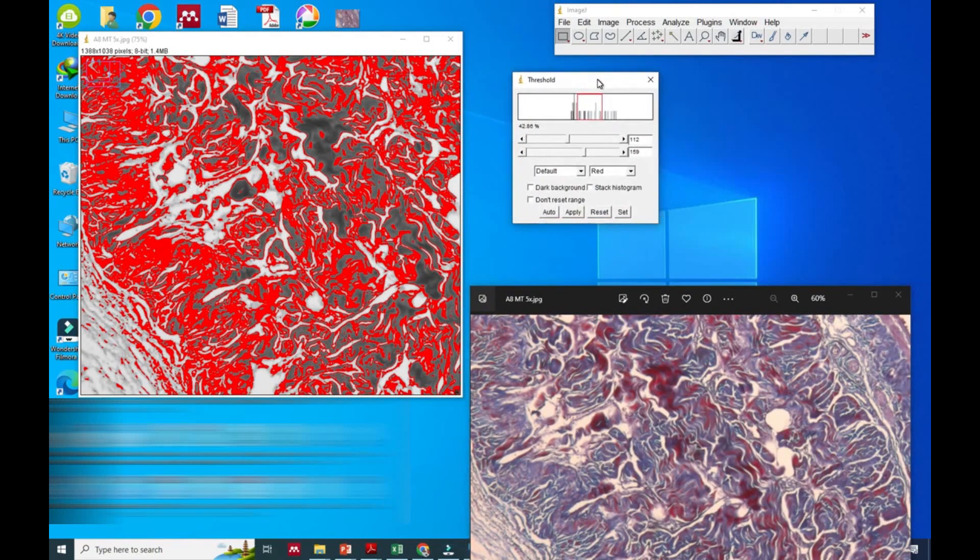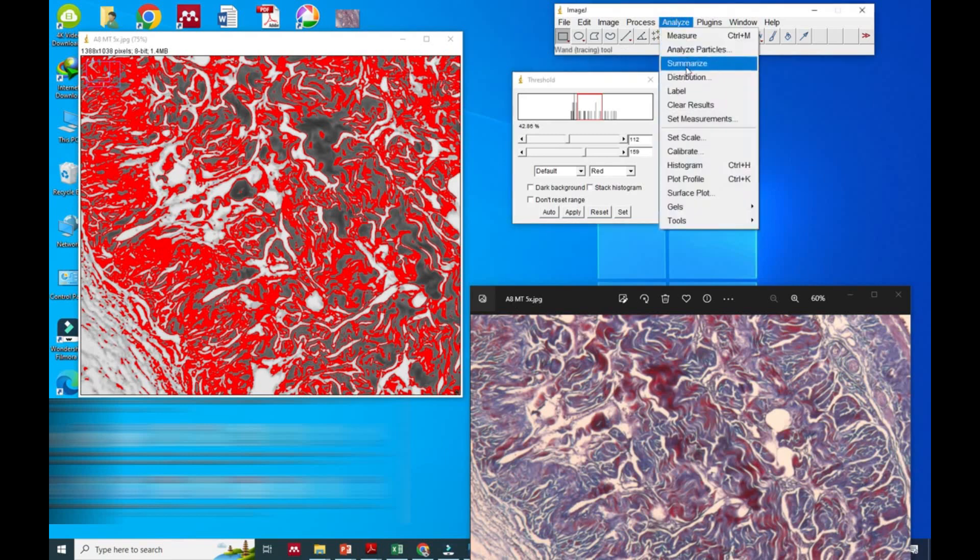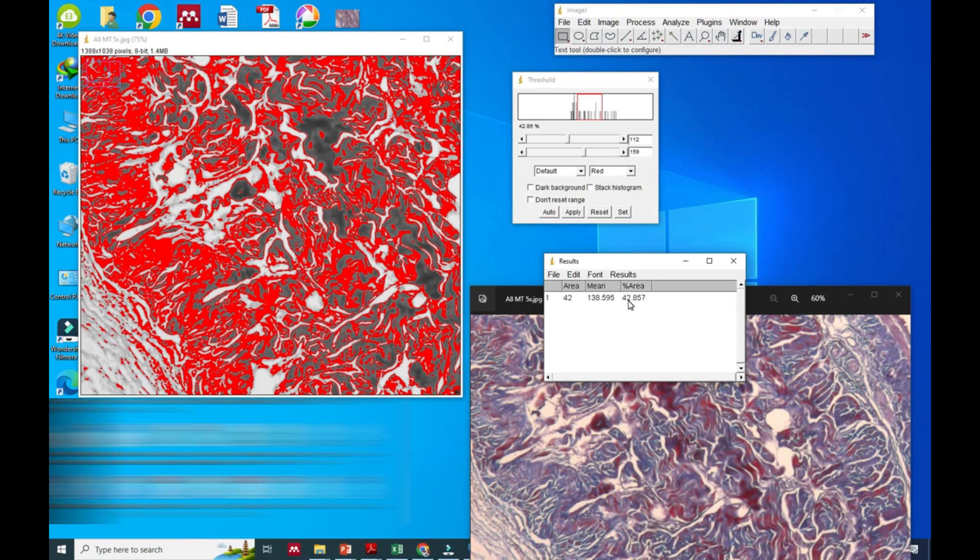Now you can see that we have selected the same area. So now we will click the Analyze option and then Measure. Here it will show the area in percentage. Likewise, you can select the red part also, and by this method you can compare both red and blue parts.